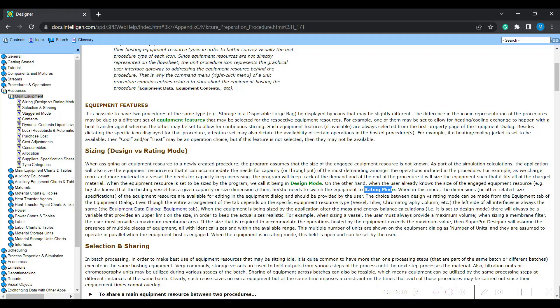There is one more mode called rating mode. On the other hand, when the user already knows the size of the engaged equipment resource — he or she knows that the vessel has a given capacity or size dimension — then he or she needs to switch to the equipment rating mode. For example, sometimes you have a constraint where specific equipment with a specific size is available, and you have to scale your process accordingly.